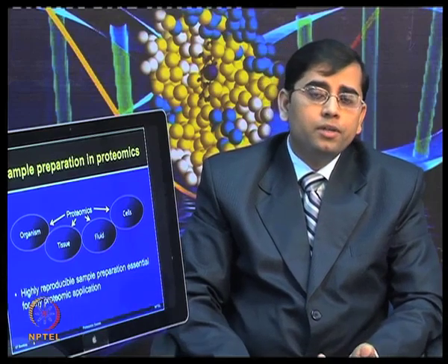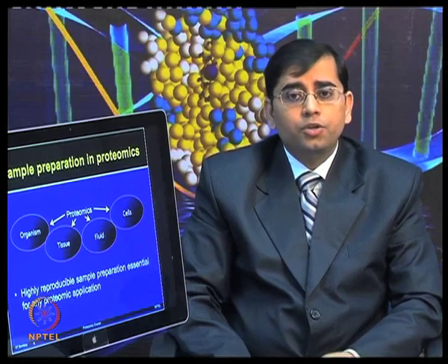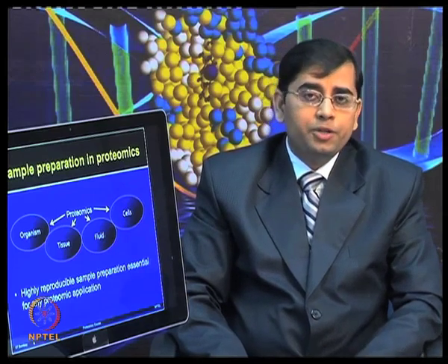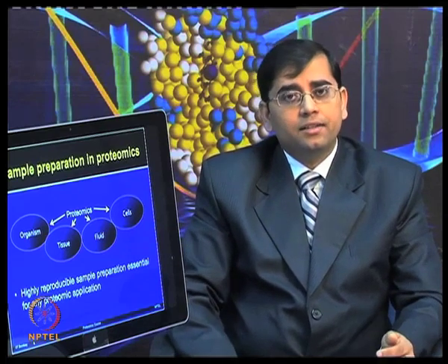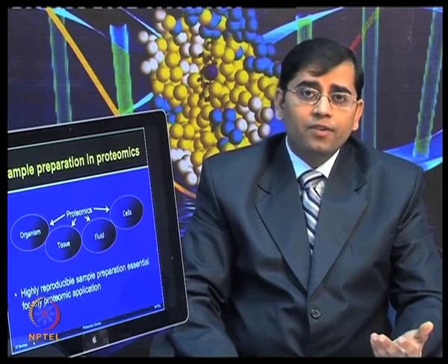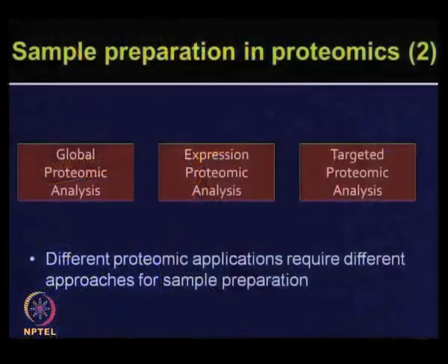If you want to know the difference in your sample as compared to the controls, you need to ensure that your sample preparation is very reproducible. If you introduce some artifacts to begin with, then obviously you are not going to identify the reproducible biological changes. So, let me give you 3 different terminologies here for proteomic analysis. One is global proteome analysis, expression proteome analysis, and targeted proteome analysis.